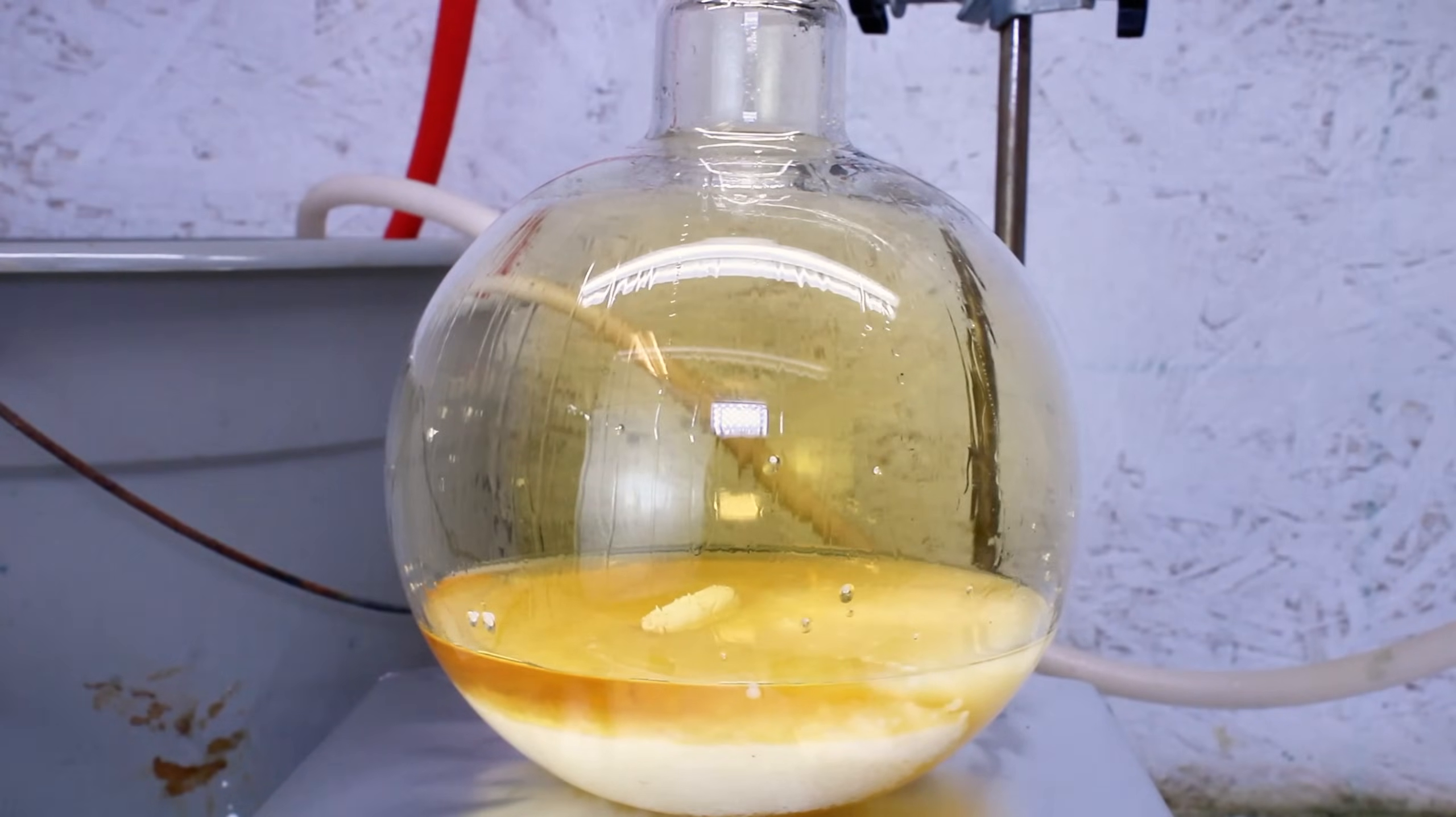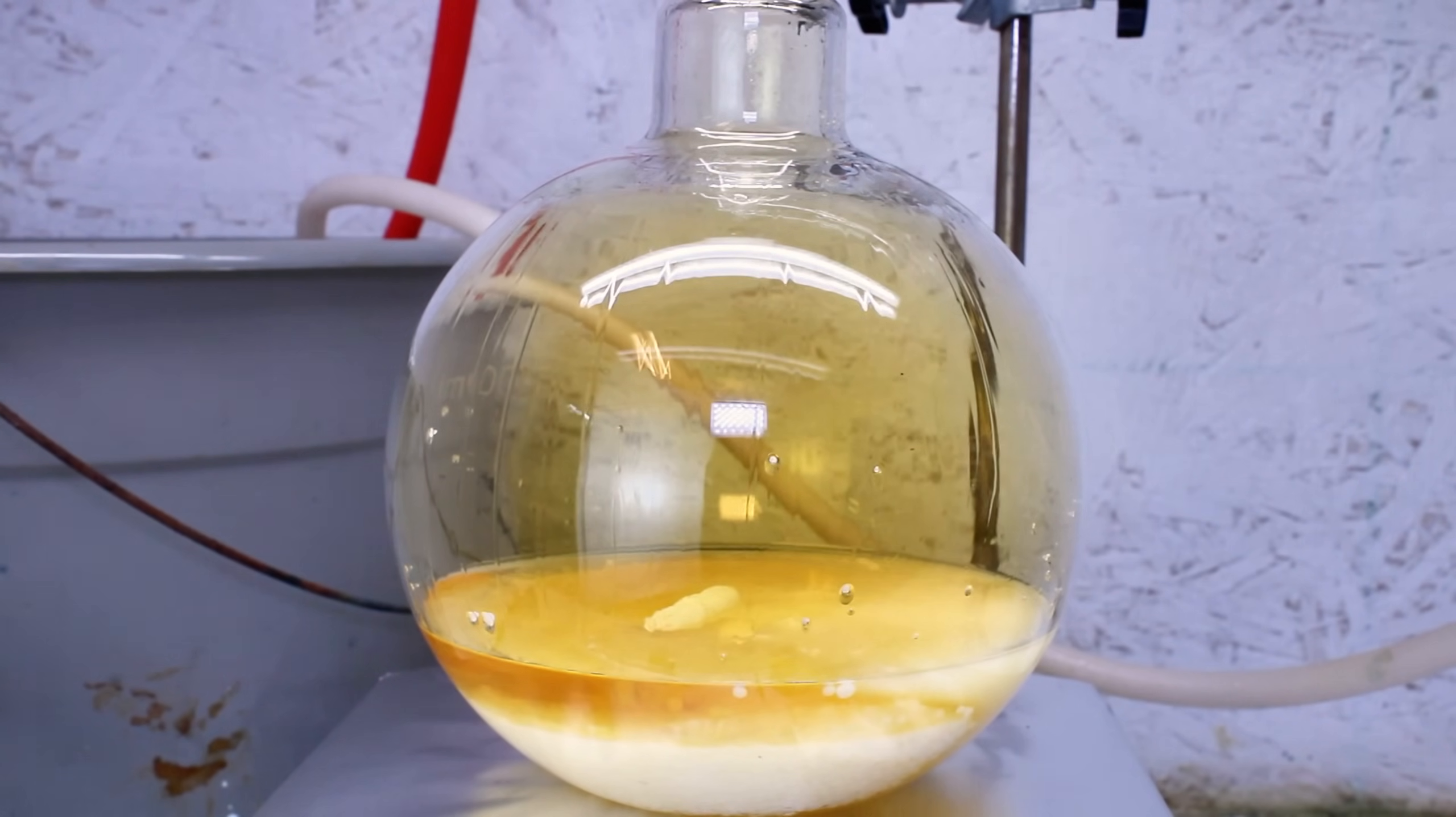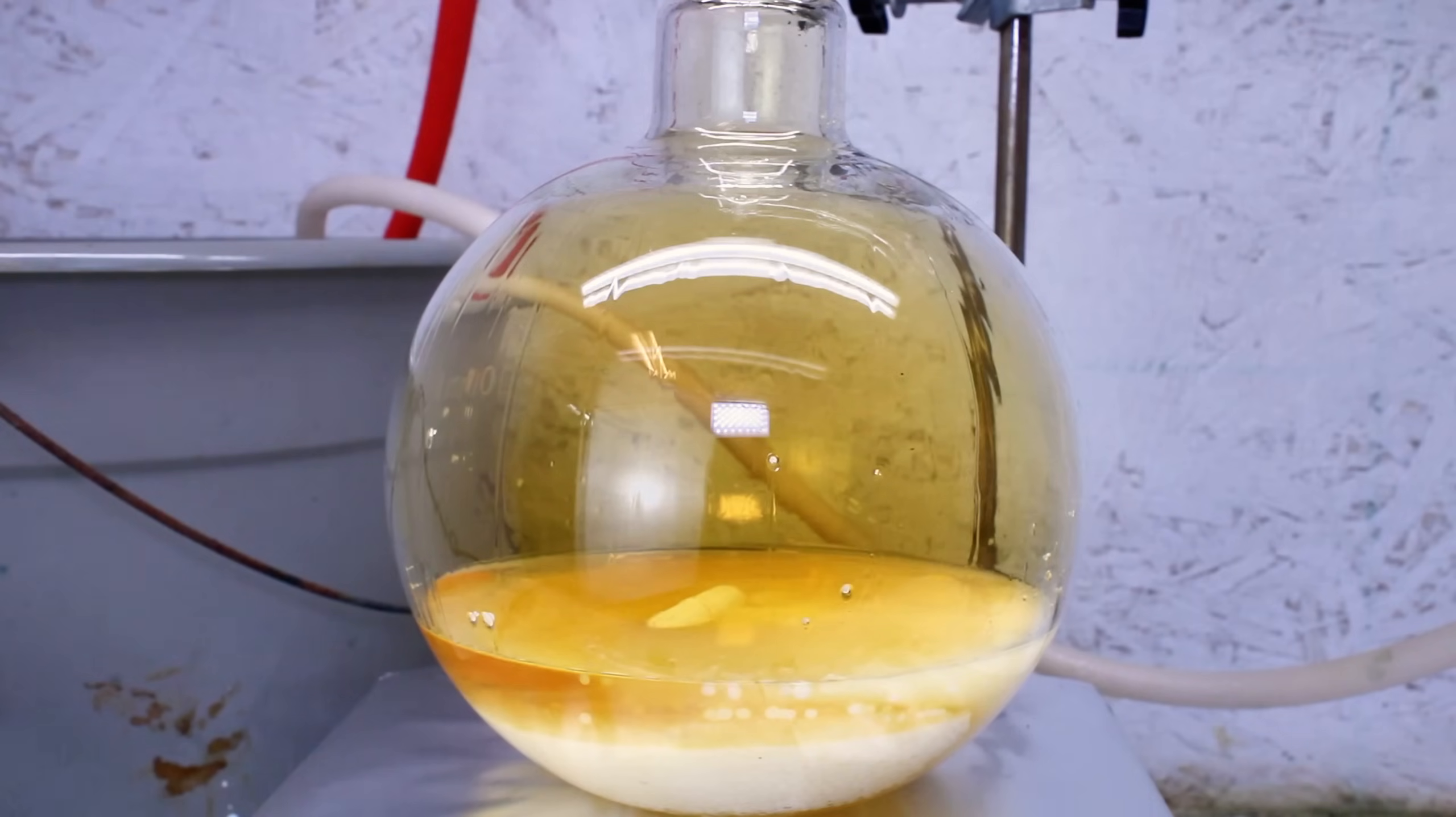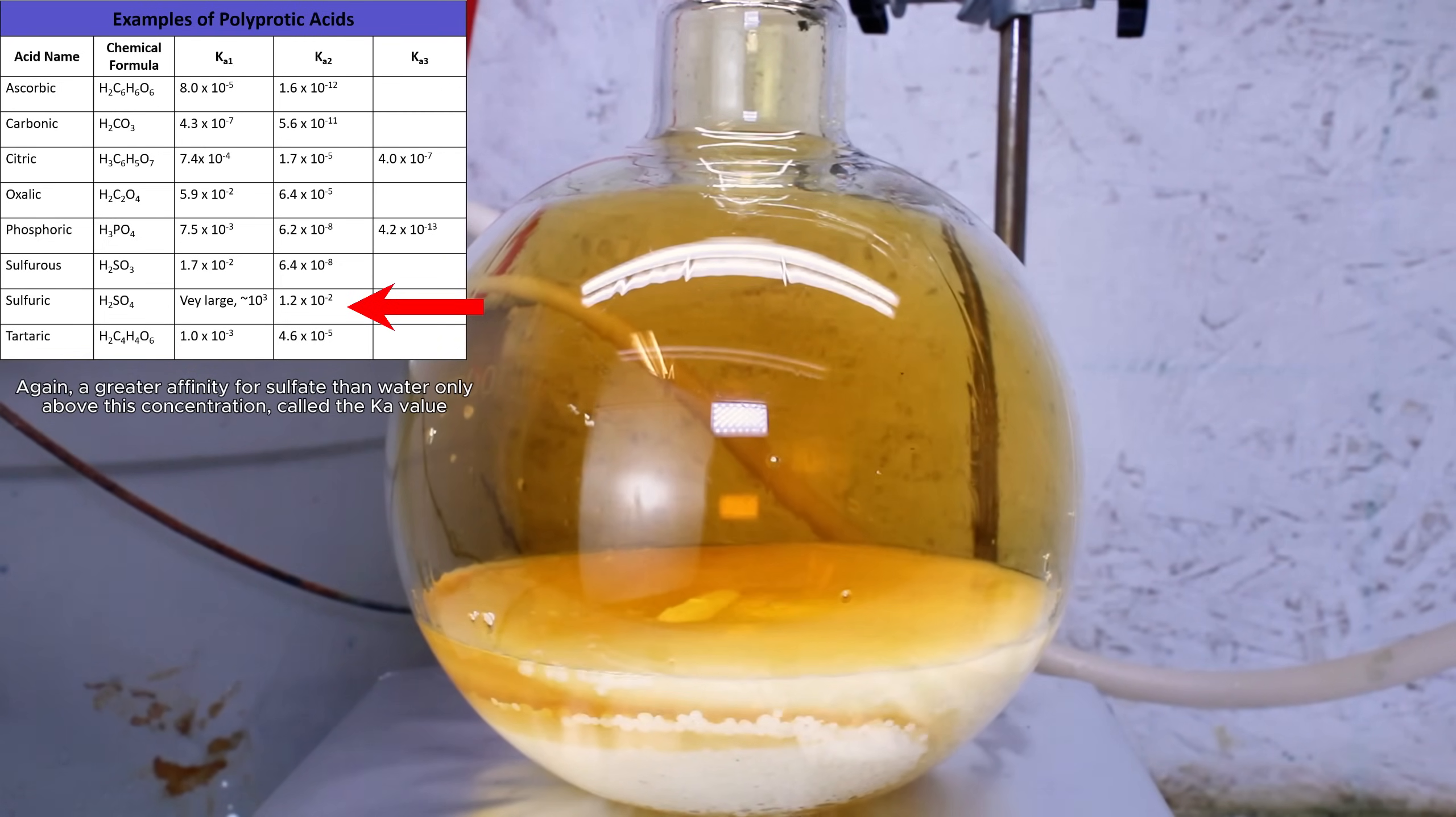However, if this reaction is conducted above 200 degrees Celsius, the two will react forming two molecules of nitric acid and the neutral salt sodium sulfate along with a good deal of foaming. This is because sulfuric acid is actually what's called a polyprotic acid, meaning it has multiple hydrogen to give up. The first hydrogen is given up very strongly, but the second actually has a greater affinity for sulfate than water, making it a weak acid.